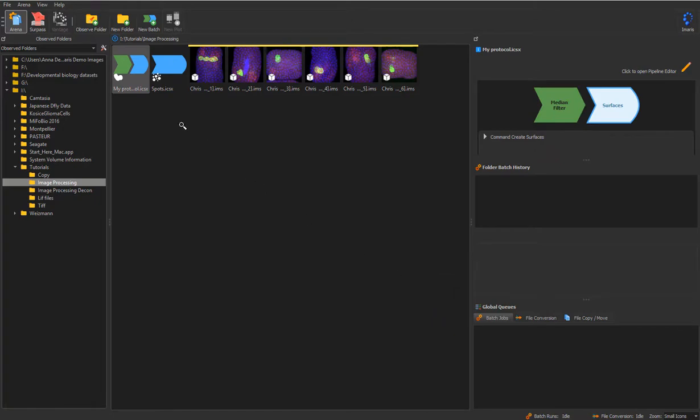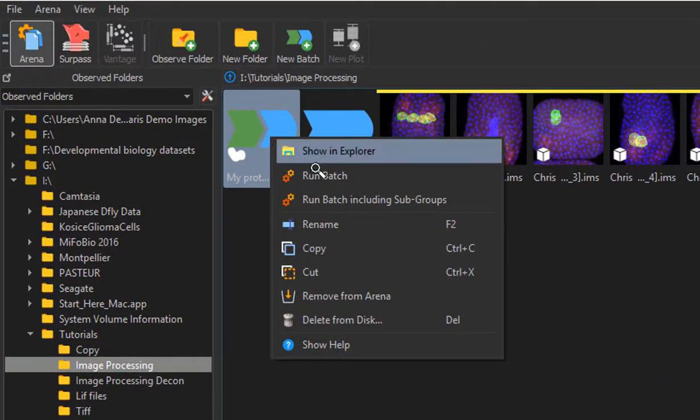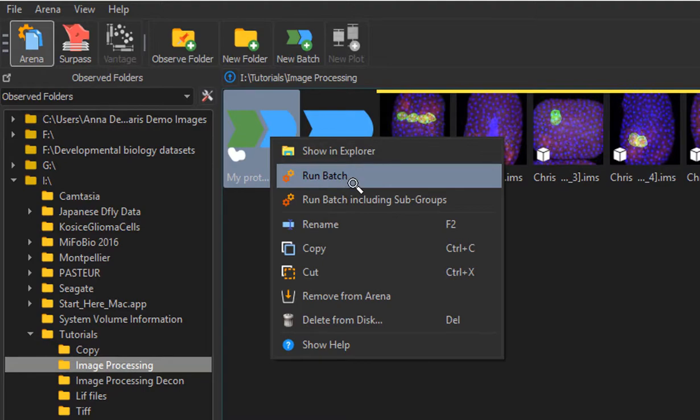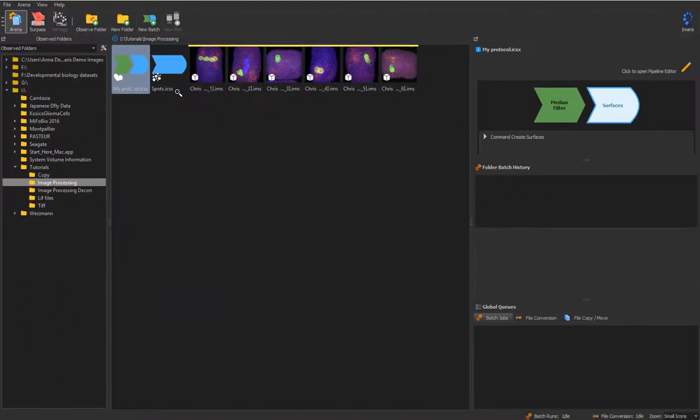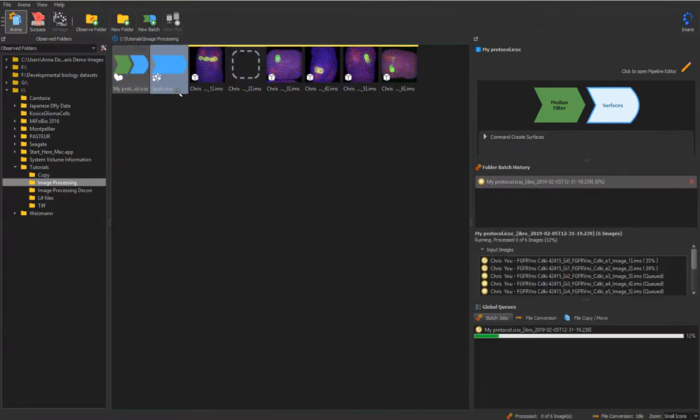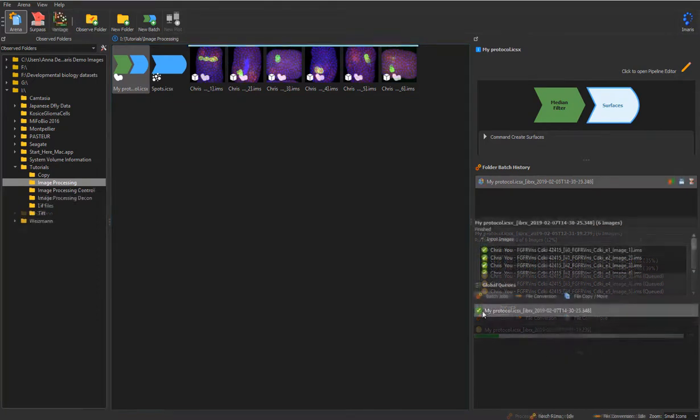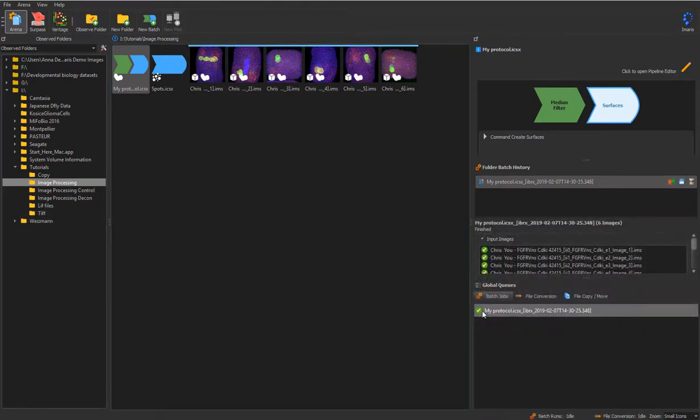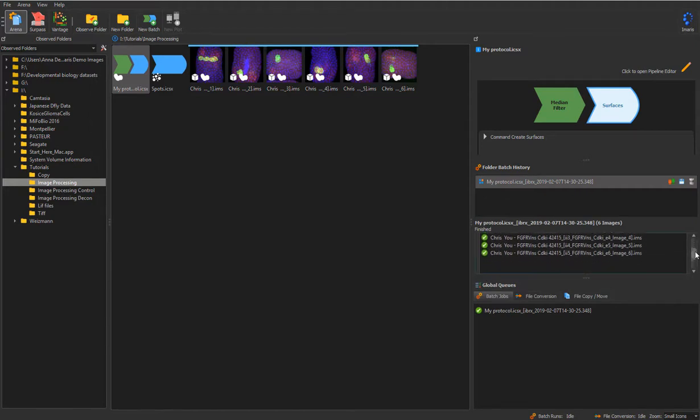Once the protocol is ready, right click the Batch thumbnail and select Run Batch or Run Batch including subgroups. Batch protocol always processes all images in the folder. Batch progress bar appears in the down right corner. Once the protocol is finished, you can see a green tick next to the protocol and next to individual images.